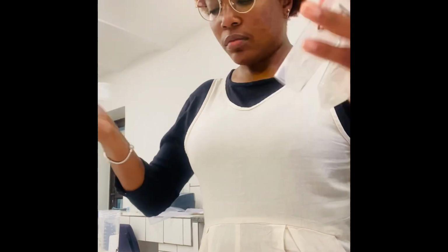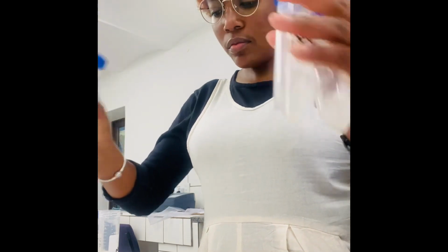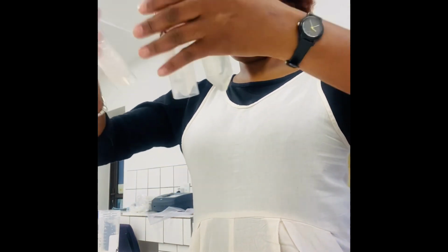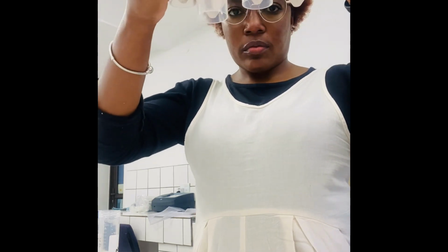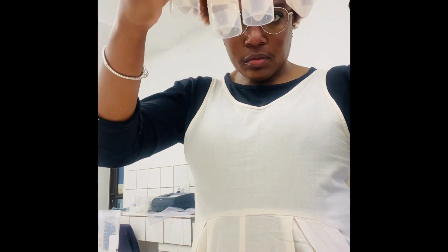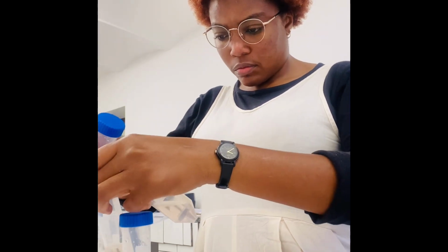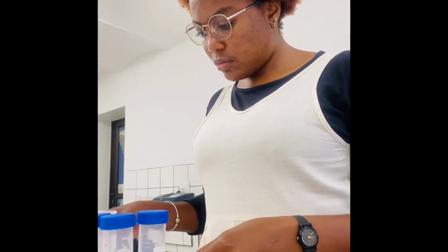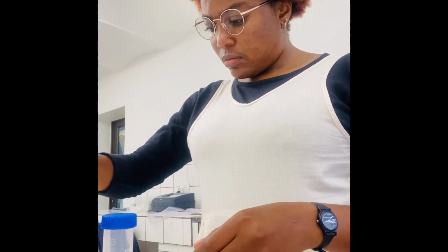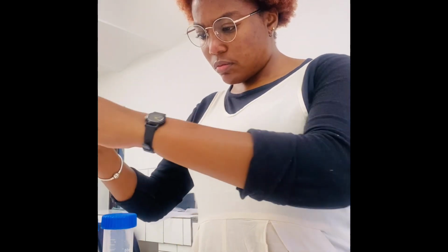Whilst for this one, the highest time for one of the nutrients is like 15 minutes of waiting. So you just wait for it to process, to settle, whatever, for 15 minutes. So in 30 minutes, you can be done with analyzing for 4 nutrients. Whilst the olden method, it's a whole day for the whole 4 nutrients. So yeah, cheers to technology, definitely.